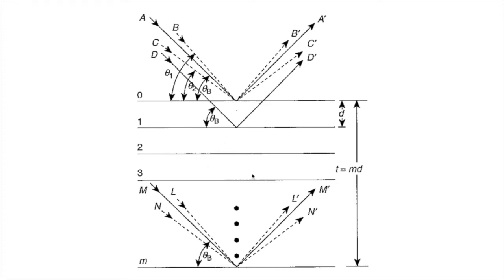And this is just showing you how that is, but really I just like to think about it in terms of you have fewer planes, and therefore you don't have the same level of destructive interference that you would with a much larger crystal, because there are fewer planes in a smaller crystal.